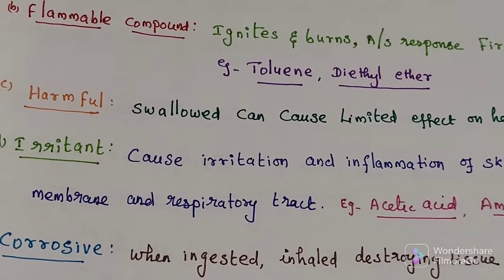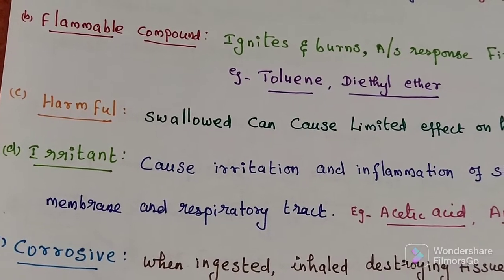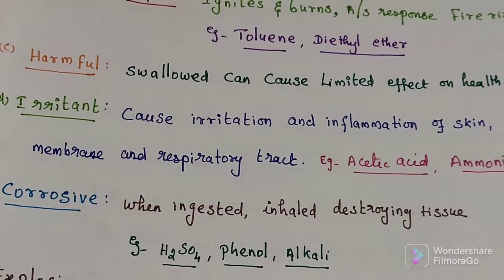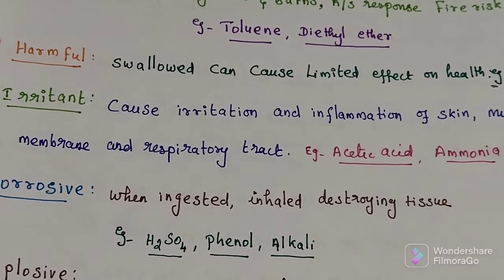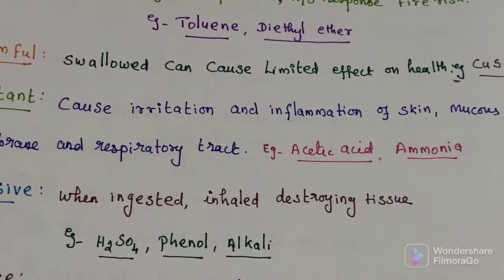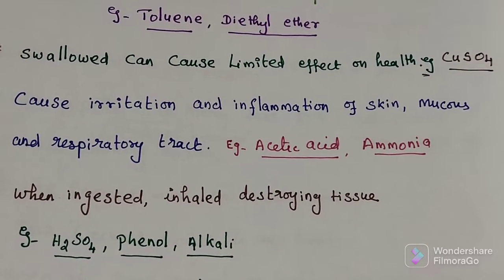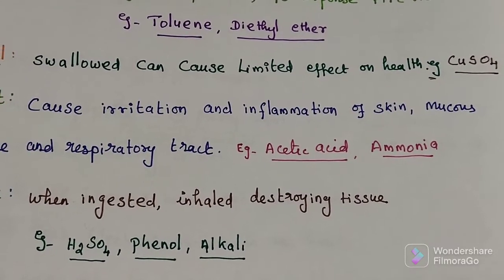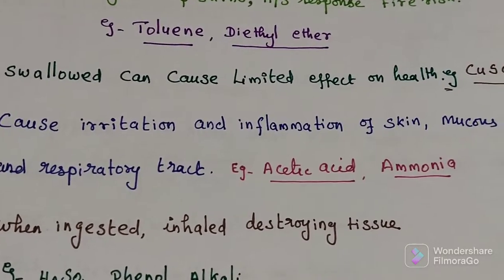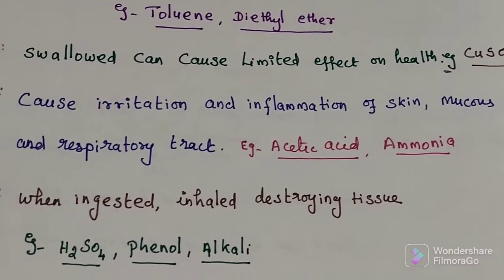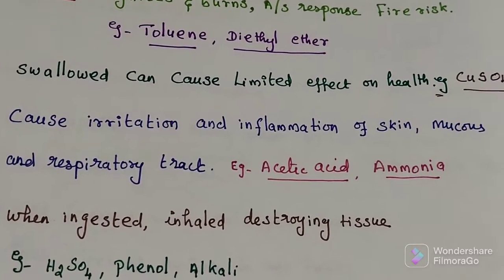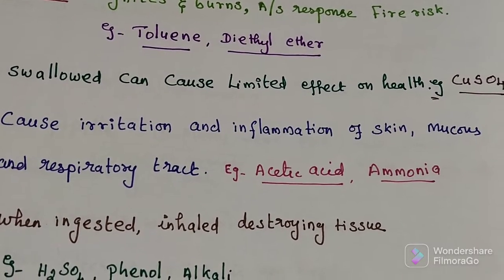The next type is irritant. A chemical which can cause irritation or inflammation of the skin, mucous membrane, and respiratory tract. Examples include acetic acid and ammonia solution.